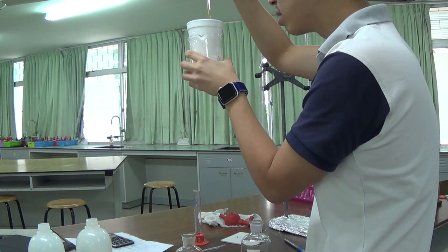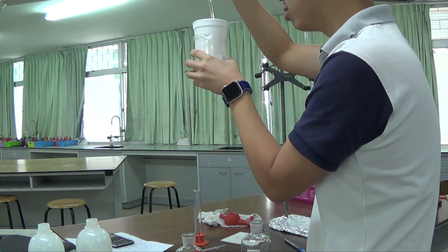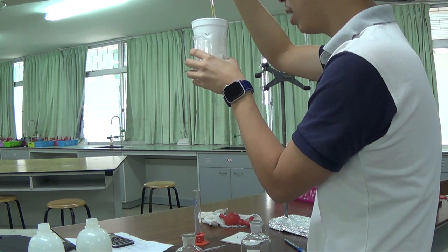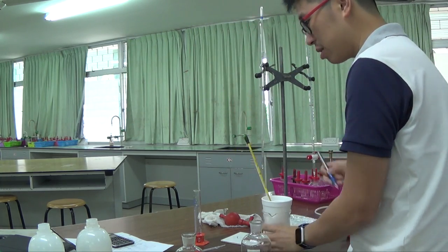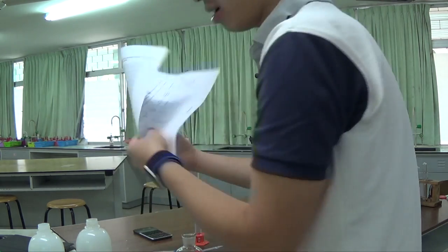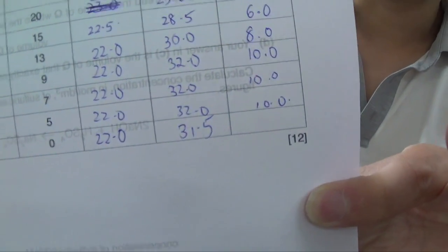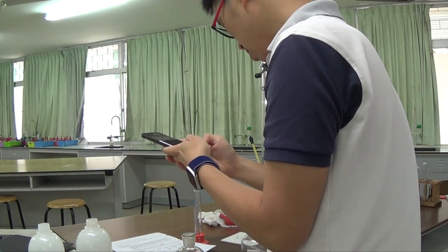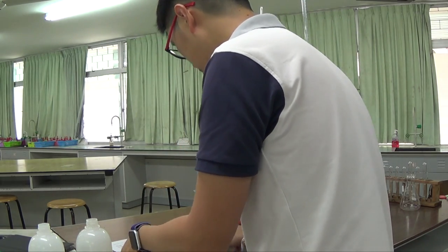And let's see, it goes to 31.5 only, it doesn't go to 32, unlike the last couple of experiments, which actually peak at 32 degrees Celsius. This one is at 31.5 degrees Celsius. As a matter of fact, this is the first one where, if you put 31.5 minus 22.0 into a calculator, you are going to get one decimal place. So this is 9.5 Celsius.